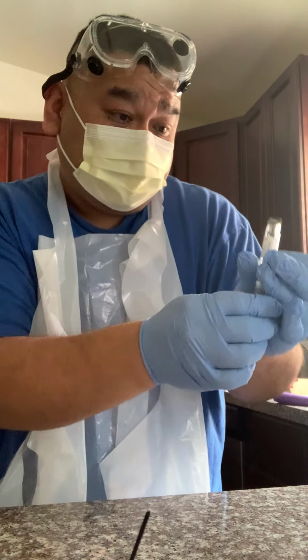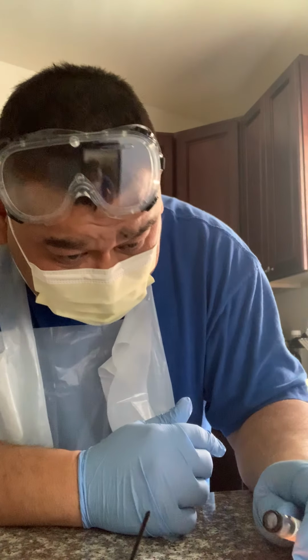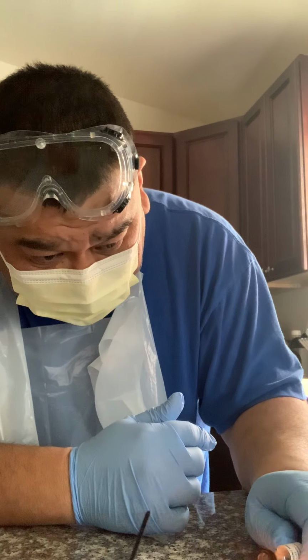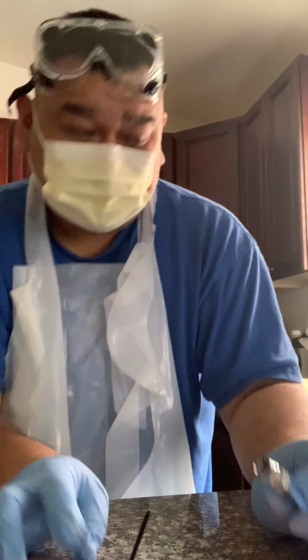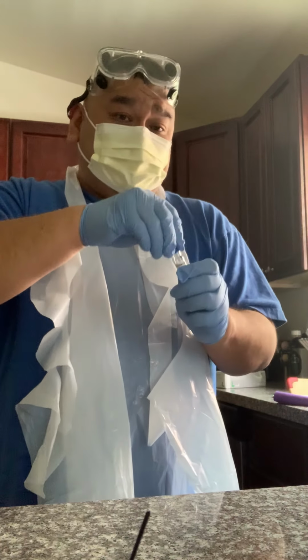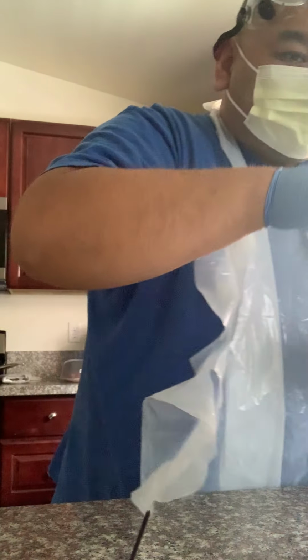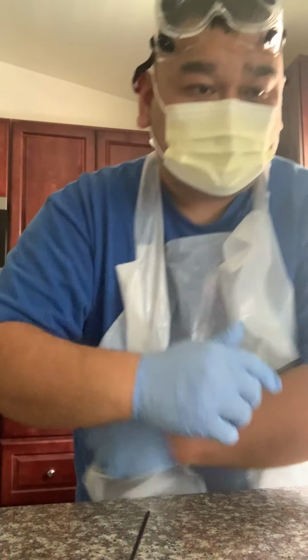Flame the nutrient broth, sterilizing it. All right, and replacing it with the cap. Extinguish the candle.